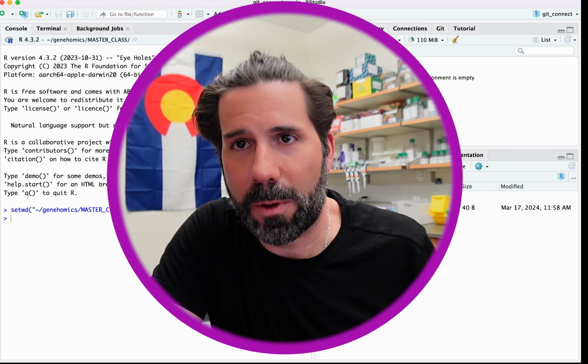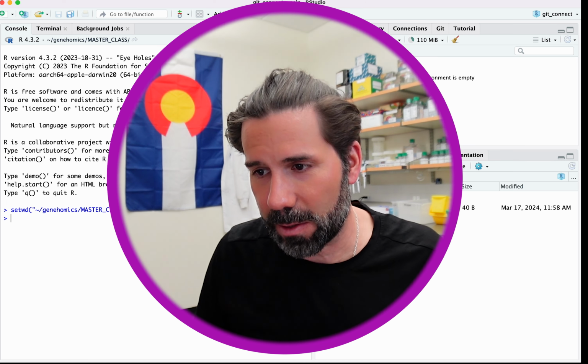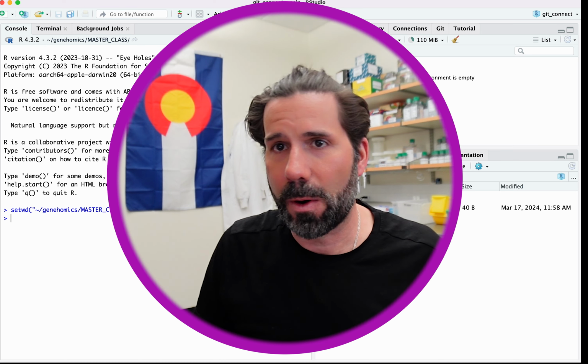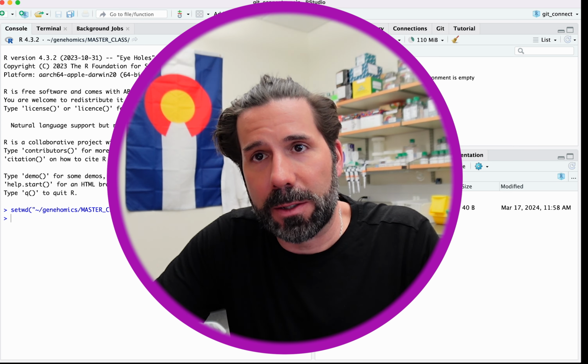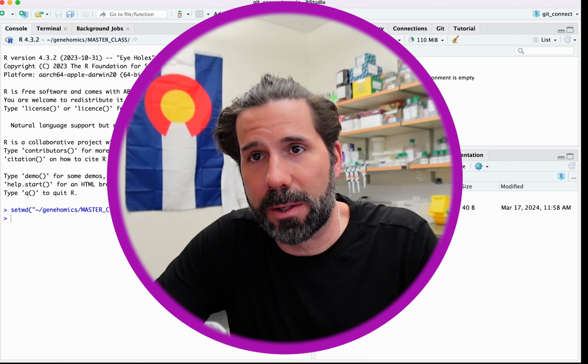Hello everybody and welcome back to the Computational Genomics Lab. Today we are going to install packages in RStudio. In the previous video we installed RStudio, kind of went over the frames, and we'll keep doing that as we go. And we are going to install our first package, and then after this we are going to actually start doing analysis and we'll be done with our setup.